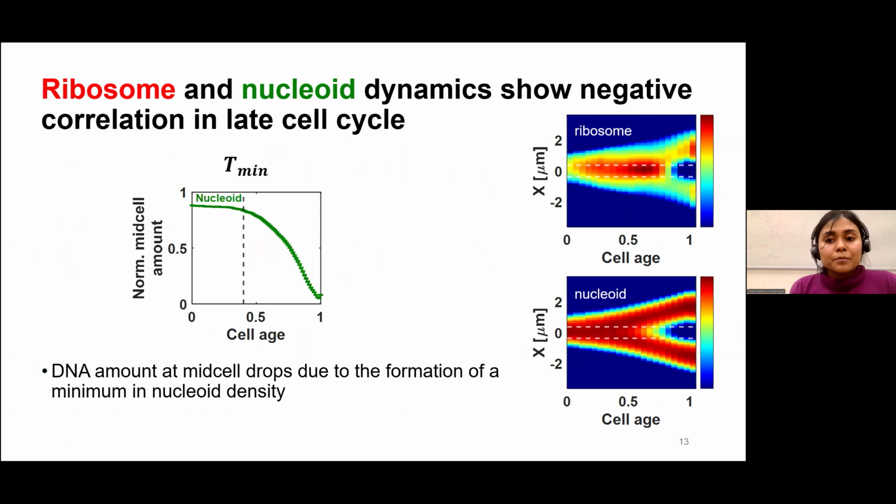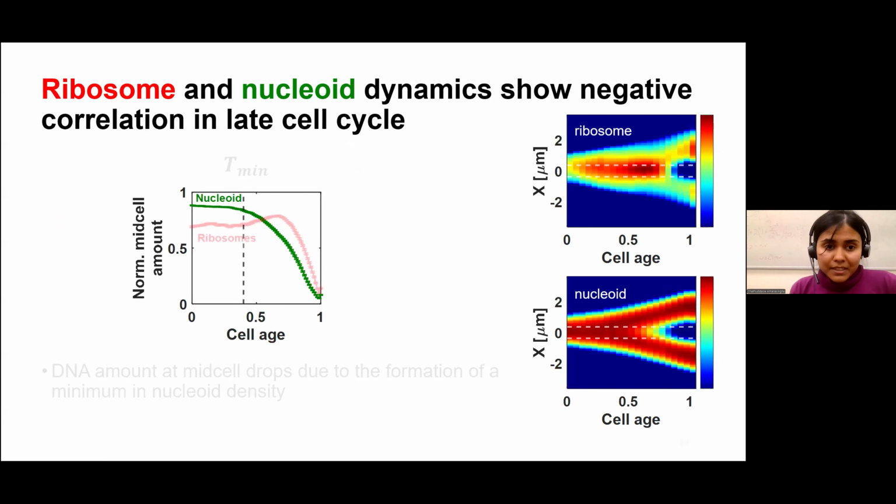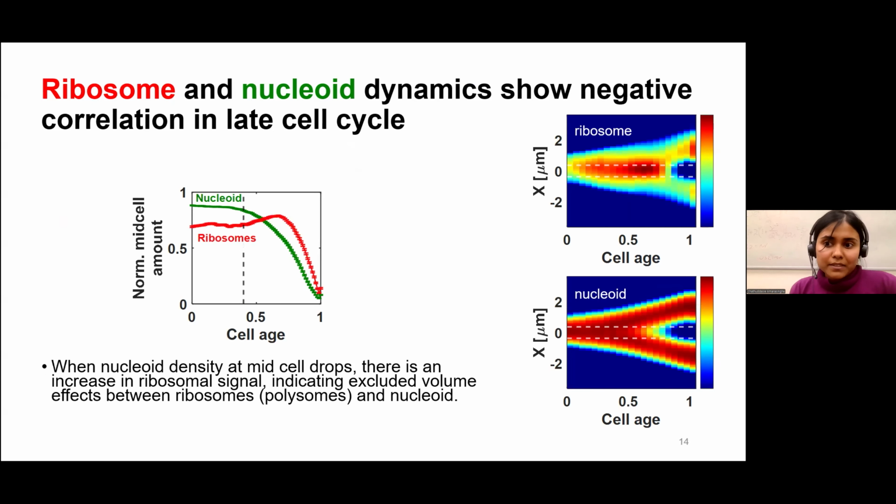And to look at this more carefully and see how these densities evolve through time, in this plot, I'm looking at the density of the nucleoid signal in a band of fixed width at cell center from cell birth to cell division. In the beginning of the cell cycle, the nucleoid density stays pretty much constant and then drops due to the formation of a minimum in nucleoid density at cell center. Simultaneously, the ribosomal density spikes up to fill up the space previously occupied by DNA material at mid-cell.